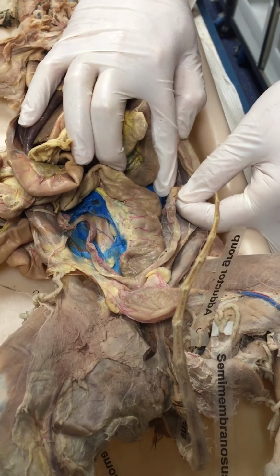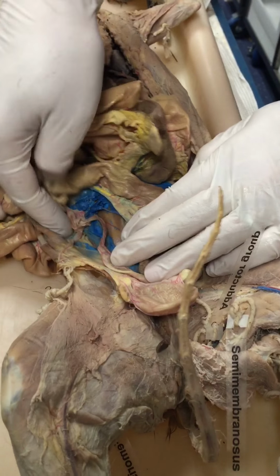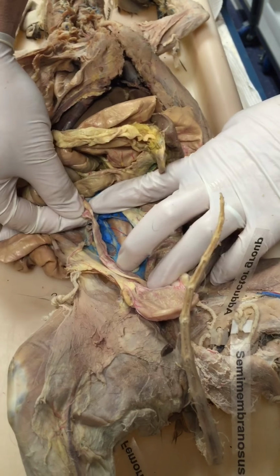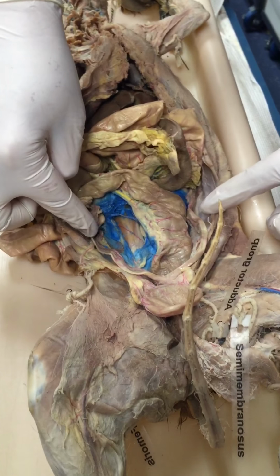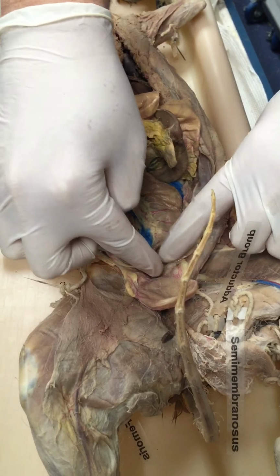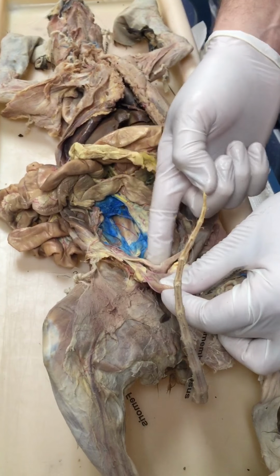That's the ovary. So this is the uterine horn here, and then the other uterine horn coming up on the other side, and then there's the other bean on this side, the ovary. So that provides multiple implantation sites for all those fetuses. If this were male, you'd pull the bladder forward and you wouldn't see the uterus or the uterine horns, it would just be the rectum behind it.